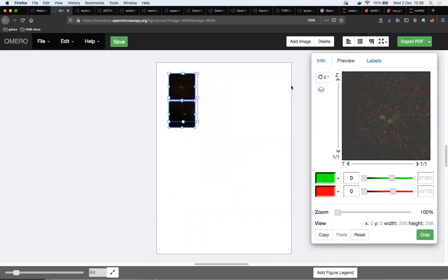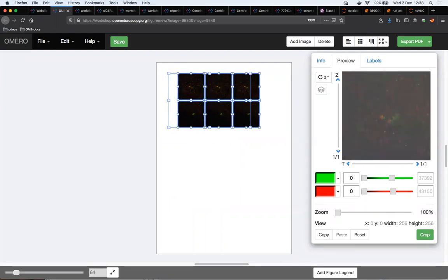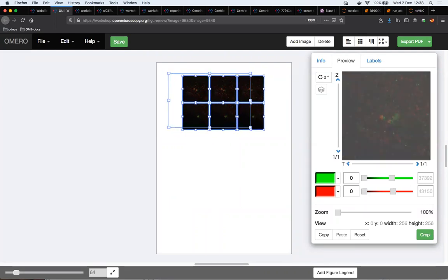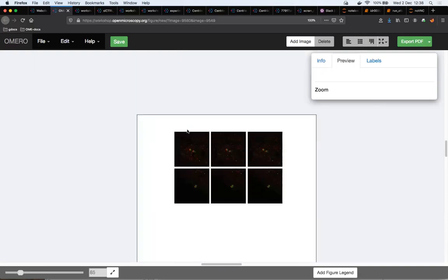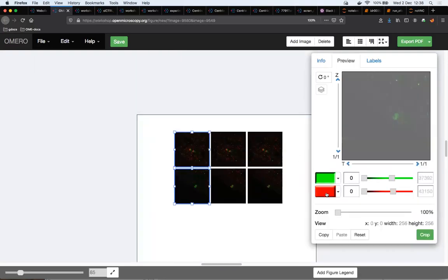to those 2 images. So I just made the images smaller, and now I will do copy and paste and paste. This is a usual trick. I showed you a taster of this already in the OMERO.iviewer, where we were doing the split view, okay? And now I will make it a little bit bigger. And now from the first column, I will do a green channel. From the second column, I'll do a red channel. And for me, it's here almost invisible.